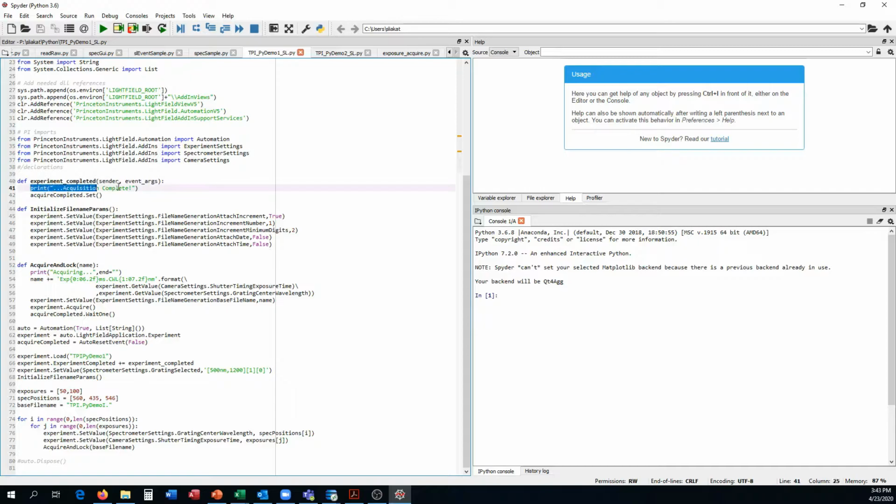So we're just going to print out a line saying the acquisition is complete, and we're going to set this event. You can cross-reference this with the material that Microsoft provides for the .NET reset event classes. What this set will do is put this auto reset event true, which means that the thread locking. I'm sorry, it'll make it back to false.